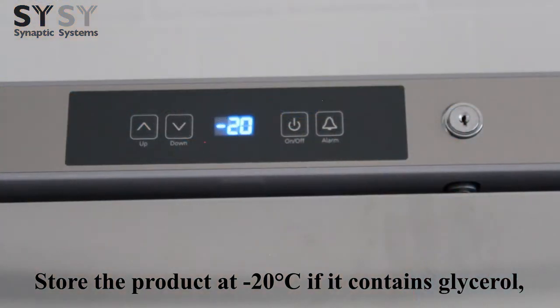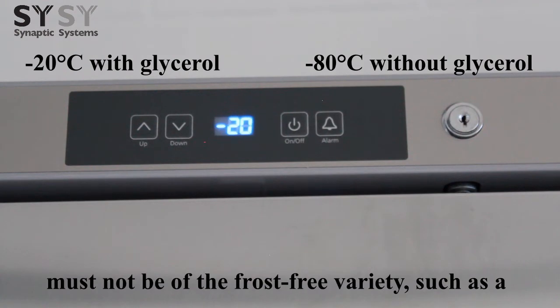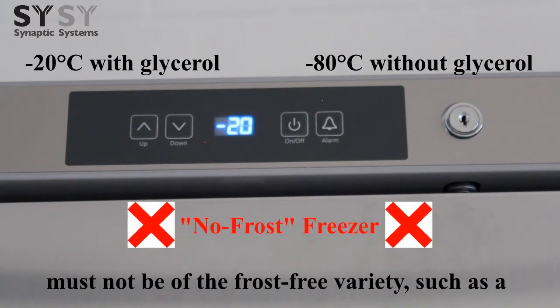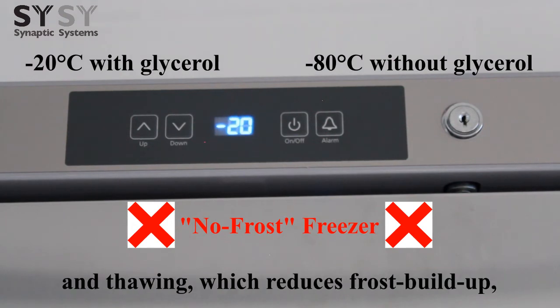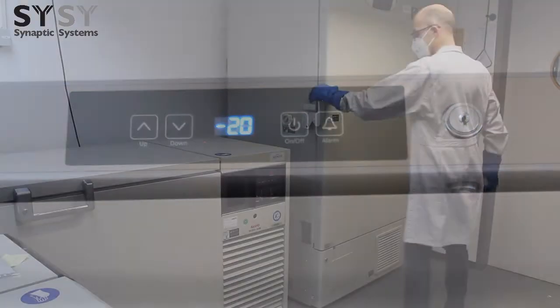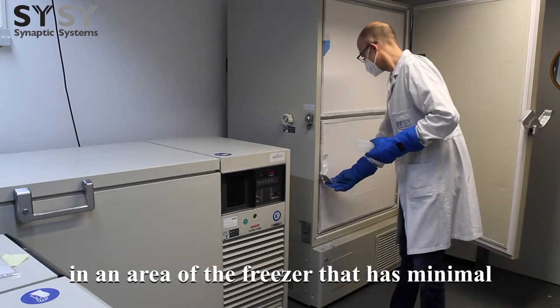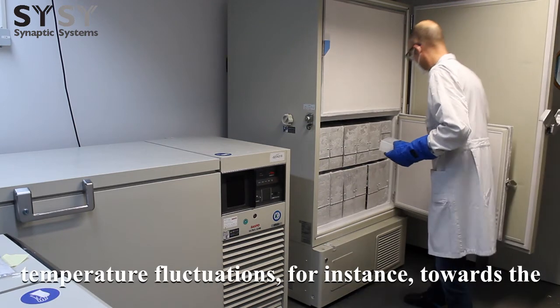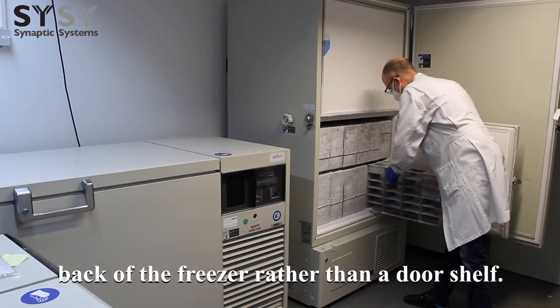Store the product at negative 20 degrees Celsius if it contains glycerol, or at negative 80 degrees Celsius without glycerol. The storage freezer must not be of the frost-free variety, such as a no-frost freezer. This cycle between freezing and thawing, which reduces frost buildup, is exactly what should be avoided. For the same reason, antibody vials should be placed in an area of the freezer that has minimal temperature fluctuations, for instance towards the back of the freezer rather than on a door shelf.